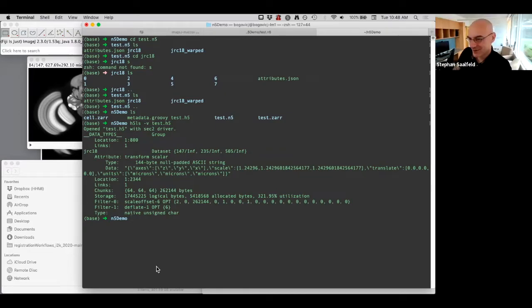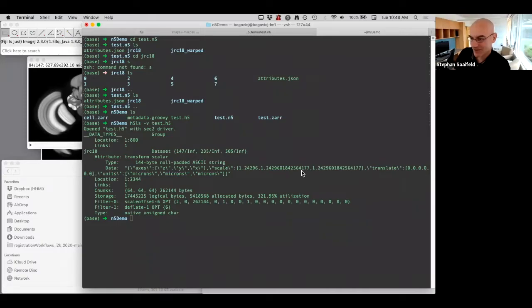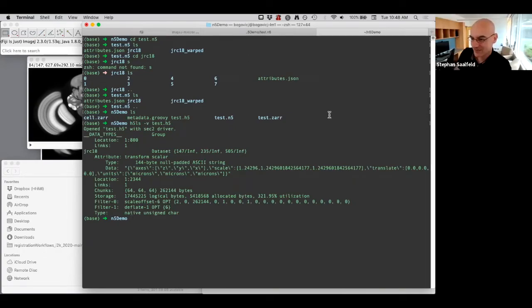Well, strings are long in terms of bytes. And they also have a precision loss when you have double numbers and stuff like that. So it's actually nicer to store uint64 as uint64. With the int, it's not really a big deal. But if you have a float64, store this as a native float64 or according to some standard instead of a string, which loses precision.